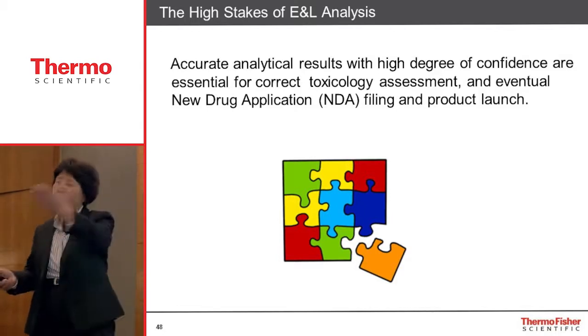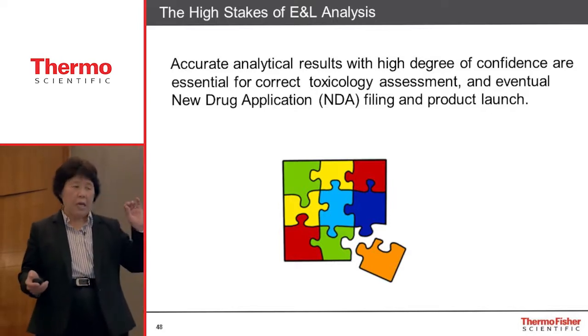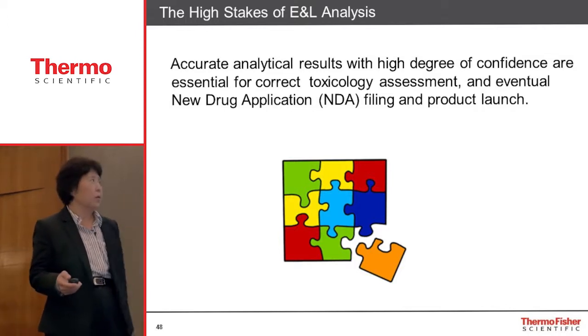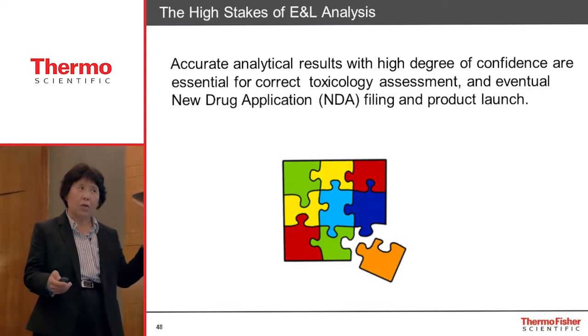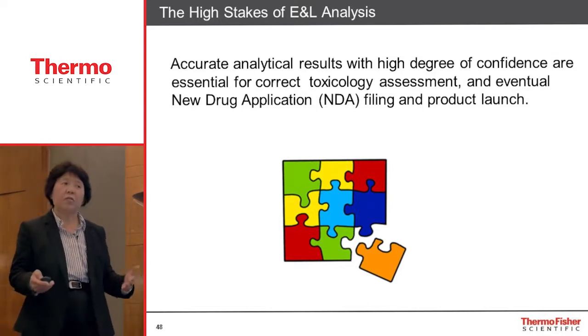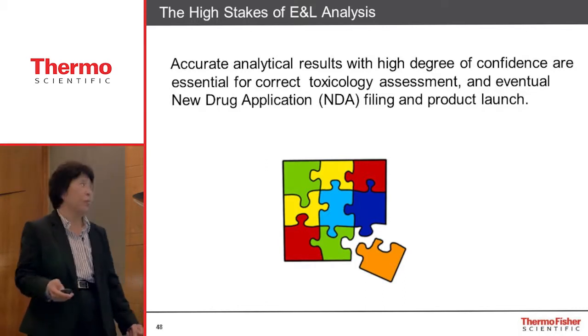I've been asking all the experts here, because we are an instrument company, about all those tox studies and how to do the evaluation. It's out of my knowledge, but our customers keep asking us, so I can feel that there are more and more E&L requests coming up.